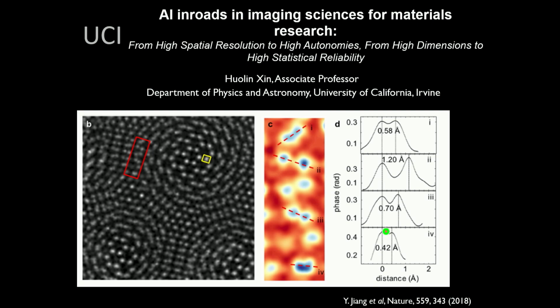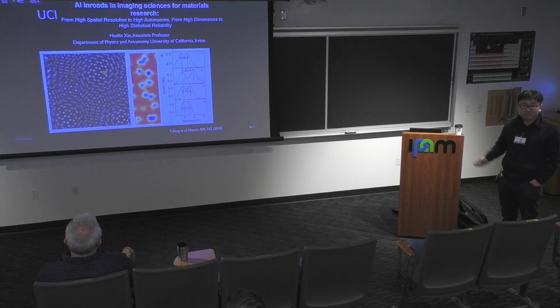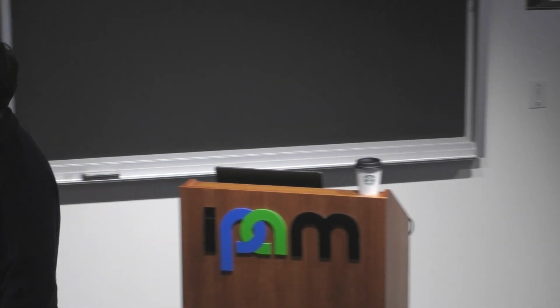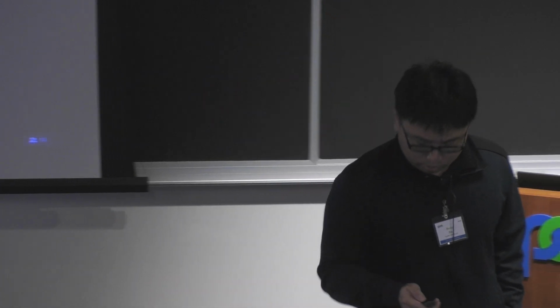On the first slide, I want to briefly showcase the data from the Cornell group. So in 2018, they claimed they had a new Guinness record on resolution. Now there is an even better one. This is the electron microscopy image showing they're actually resolving a 0.42 angstrom resolution.